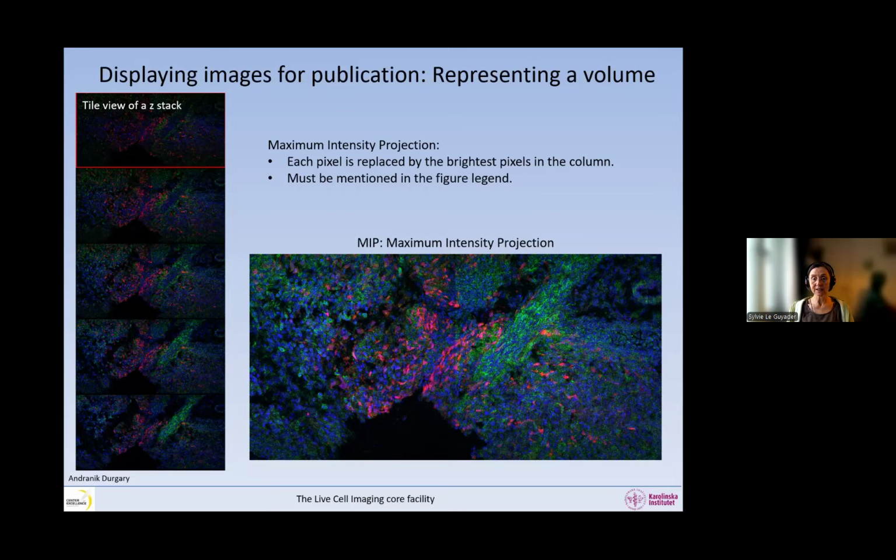So that's very nice. But if your objects are very crowded and your Z stack is a little bit much bigger than the objects, let's say, then you may have two objects that are in the same column of pixels, and there the brightest will show and the other one will just disappear. So depending on your image, on your Z stack, you can use a maximum intensity projection or not. Clearly, you can also make a video going through the Z stack and put this in the supplementary material.